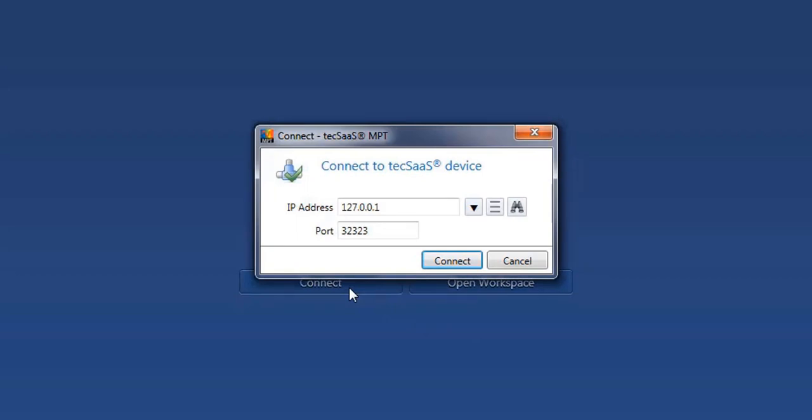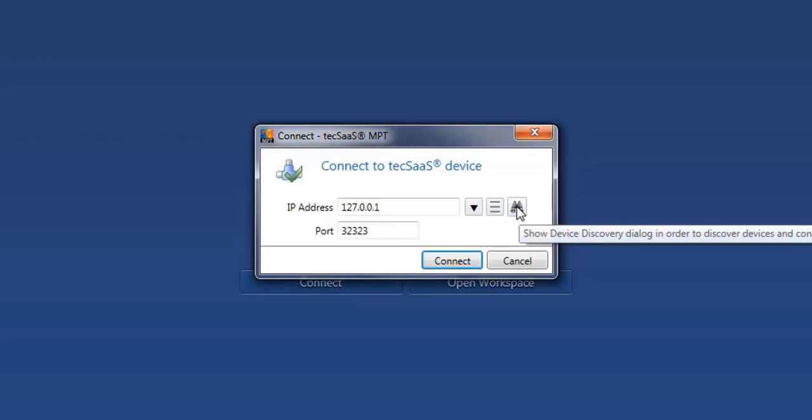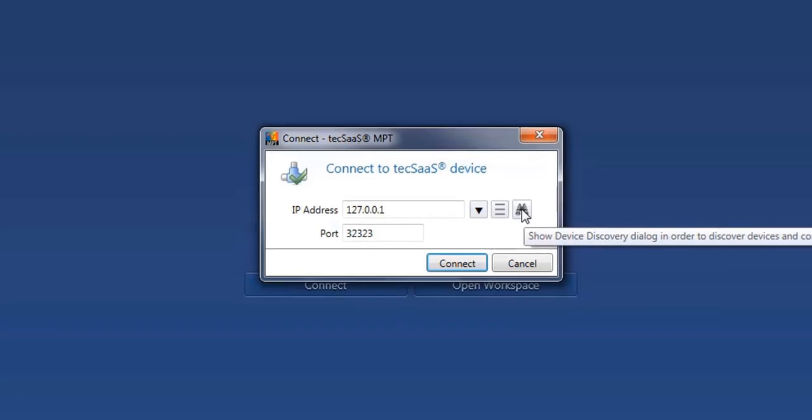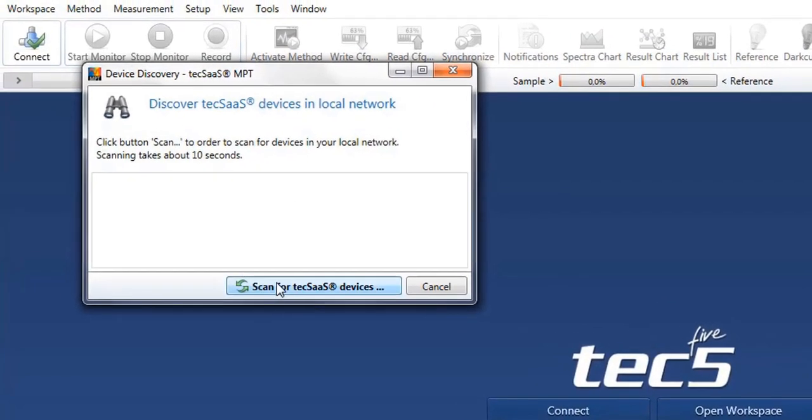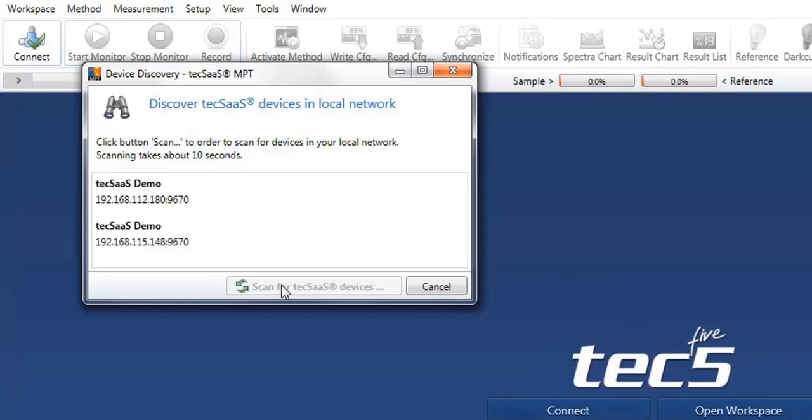You may now enter the IP address of the system directly and the suitable board or alternatively use the button device discovery to show you a list of available devices. After completion of the scan, available devices in the network are shown.